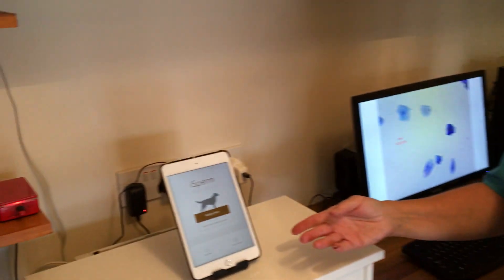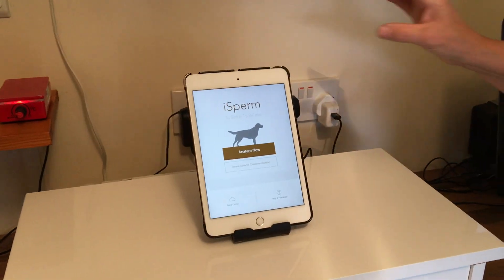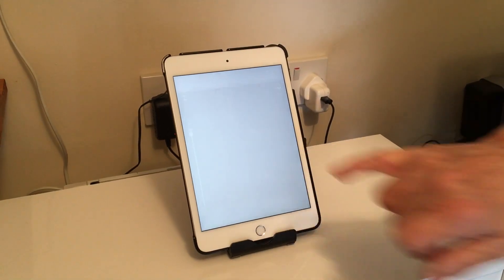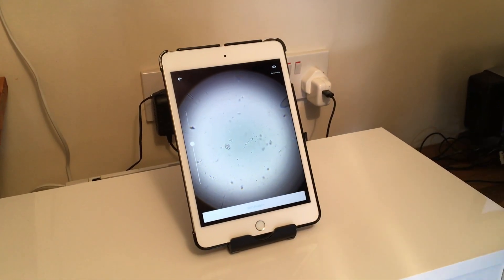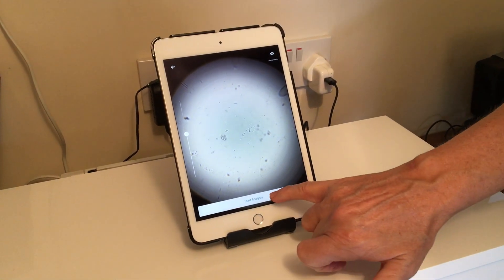So this is what we use - we use the iSperm. Our sample is already loaded into there, it's already in the microscope at the back, so we simply click Analyse, Start Analysis. Oh, don't think I pressed it.